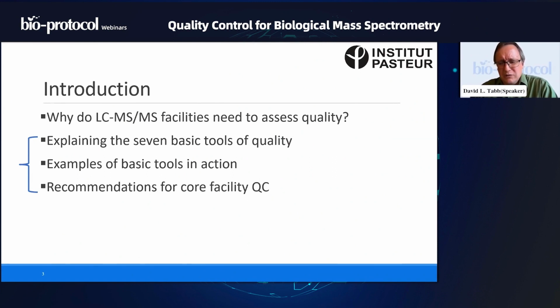So for that, I'm going to walk through the 7 basic tools of quality as presented in a rather classic book on quality control. But for each of these basic tools of quality, I'm going to try to link them to how these tools play out when we're working in proteomics, and also try to tie these to different recommendations that people can use, especially if you are running a core facility, to ensure that the data you return to facility users come with a package that accredits those data, that says these are solid and worthwhile.